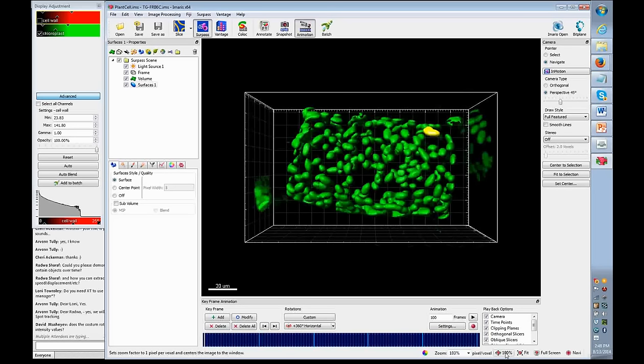And at this stage, we have the quality filtering, and it looks pretty good. Of course, if you have a time series, you'll want to drag along the time slider that just appears along the bottom whenever you have a time series to check and see how the segmentation is doing at other time frames.